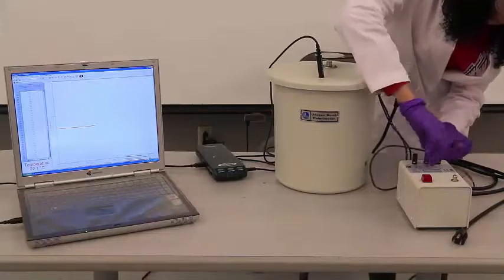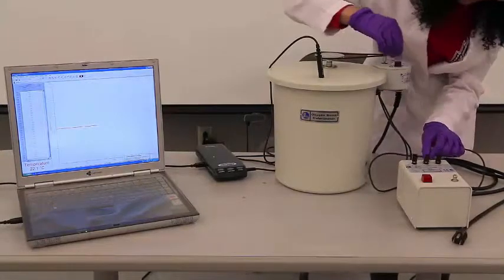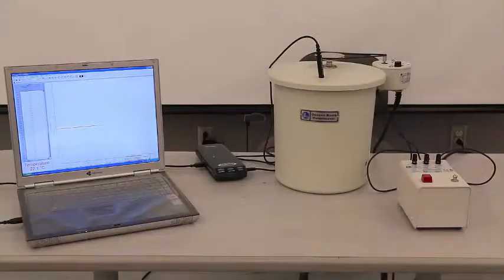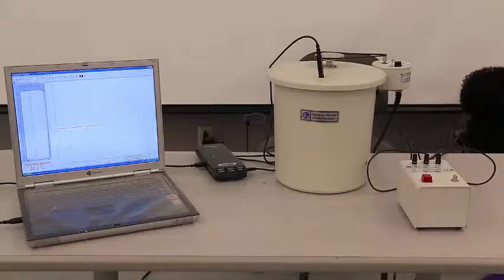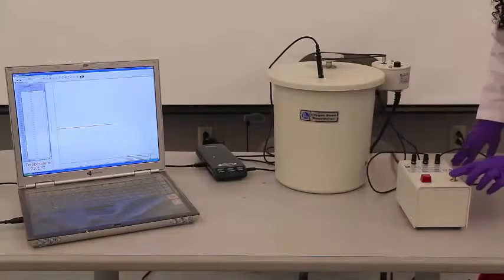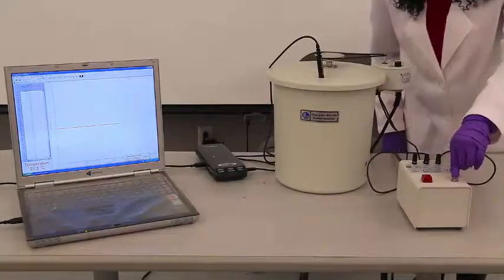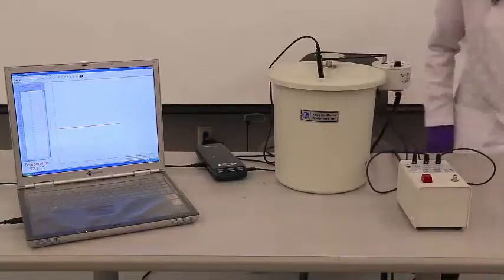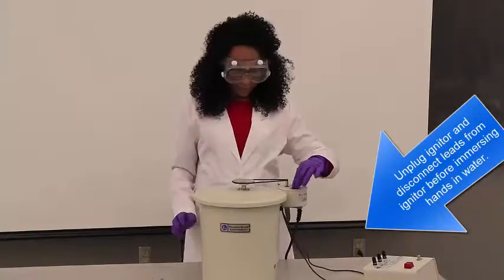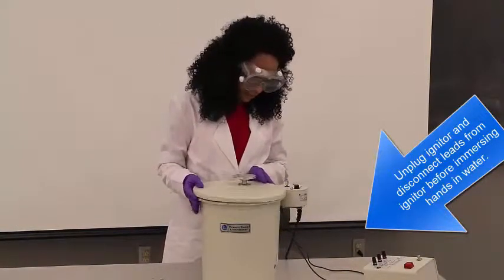With the igniter still unplugged, attach the wires to the appropriate terminals. Now, plug in the igniter and ignite the system by pressing the ignition button for no longer than 5 seconds. The red light should turn on and then go off, signaling that it has ignited.